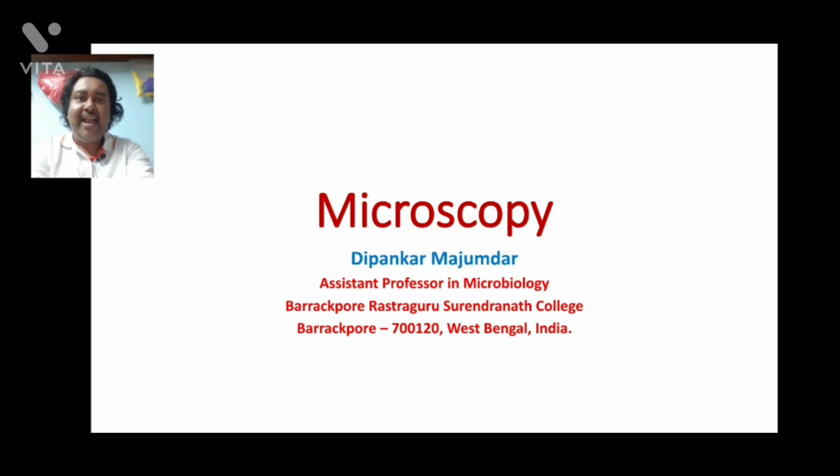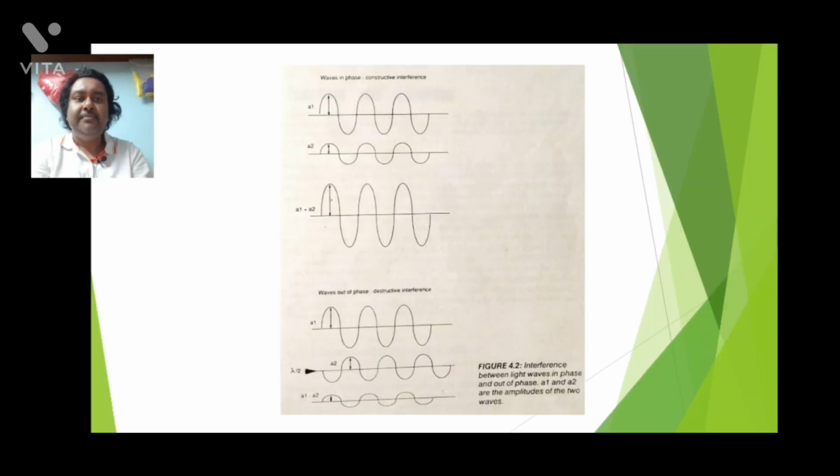Now, phase shift. Please see, at the top of the diagram, there are three wavelengths of light. The first has an amplitude of A1 and the second an amplitude of A2, but both lights have the same crest and trough, and both wavelengths are the same.